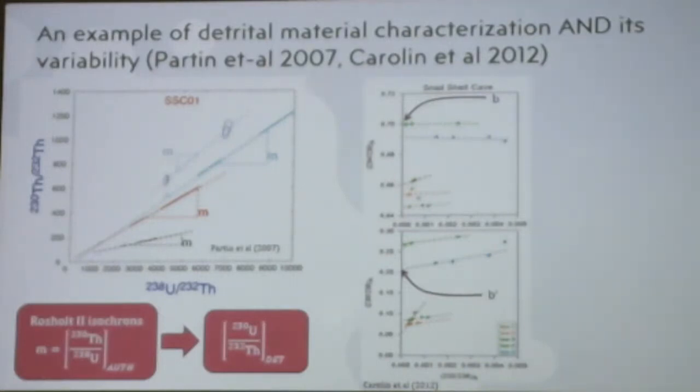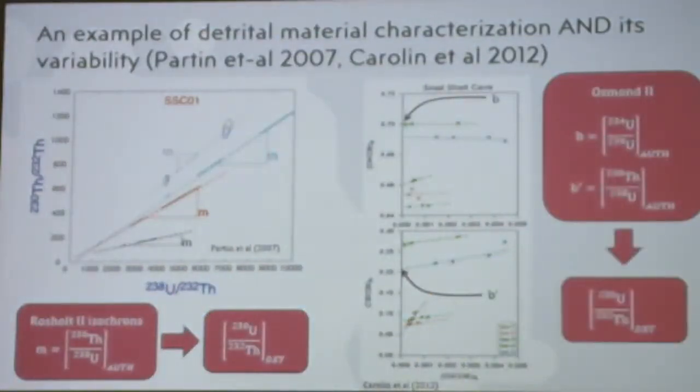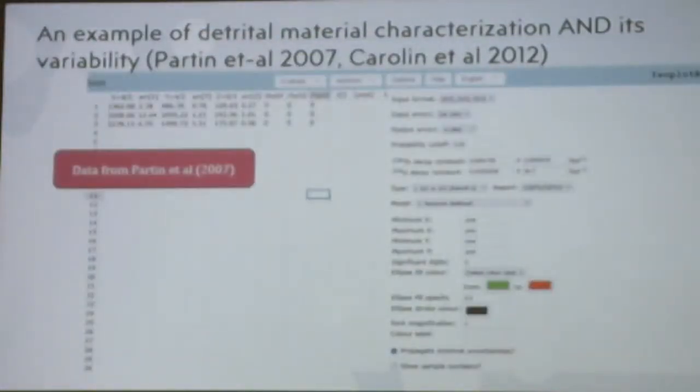You can find the data for these plots also in the file that I sent you. And they calculate the data for the authigenic phase and the detrital. So taking the data, you can do it here, they go to an isochron, the uncertainty levels, the output errors, and the correlation. We are going to be using what is called a maximum likelihood.